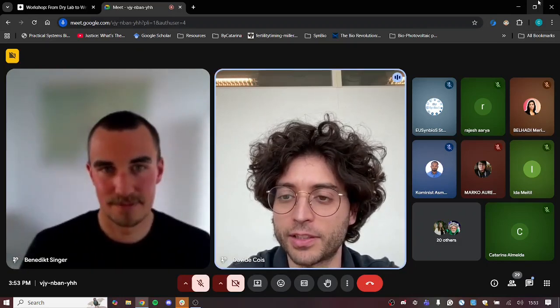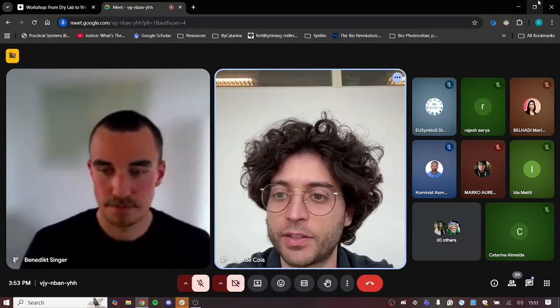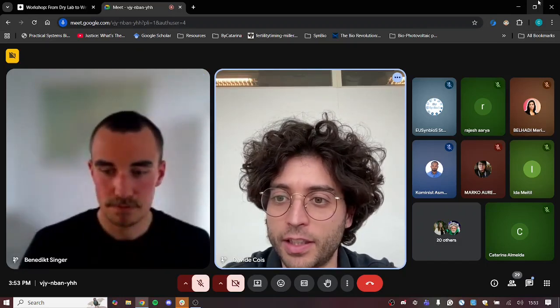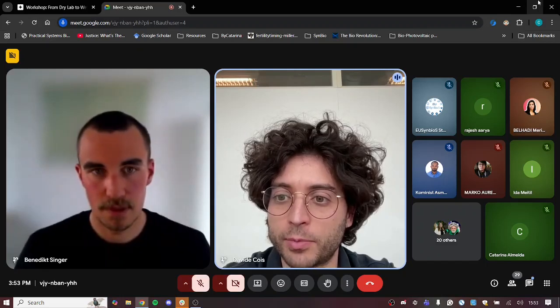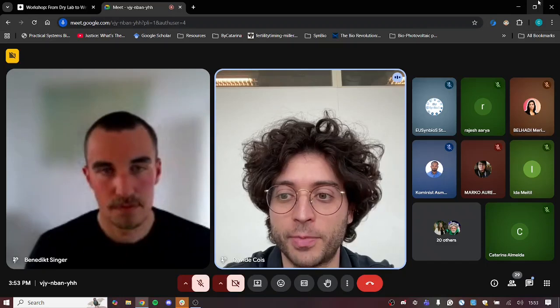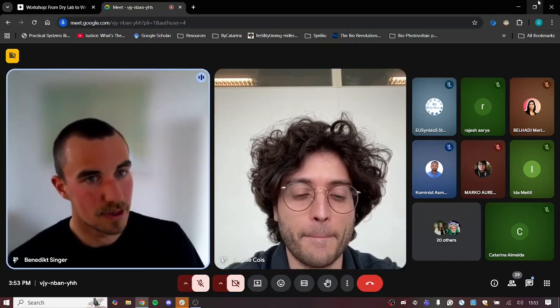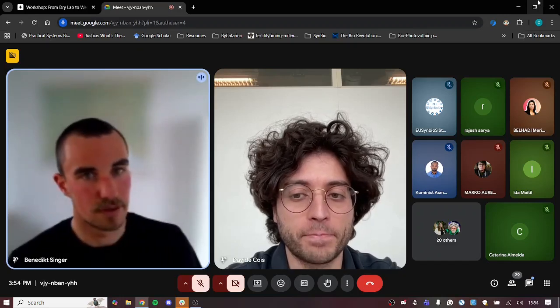I will start reading some questions from the chat. The first one is by Catherine. She asks, are there tools to design proteins that change conformation upon binding? For example, for cooperative binding of multiple ligands? So there's not really a direct tool, but there are ways to get around it.